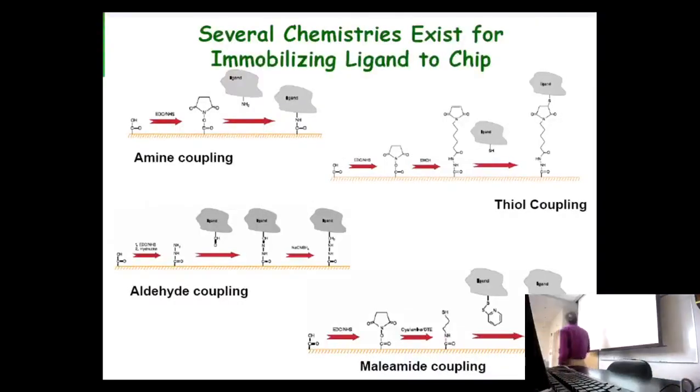Here's the organic chemistry for those of you into organic. What we do is they use an N-succinimidyl group. And it's called amine coupling because you have the carboxyl on the dextran. You add the N-succinimidyl group, and that activates it. Then when you flow a protein over, any amines on that protein, any positively charged nitrogens, can then displace the succinimidyl. When they do that, this bond is broken, this bond is formed, and you have an amide, a nice tight covalent amide bond. The one thing about this, once you do this, you're not going to reverse it. You're not getting that carboxyl back.